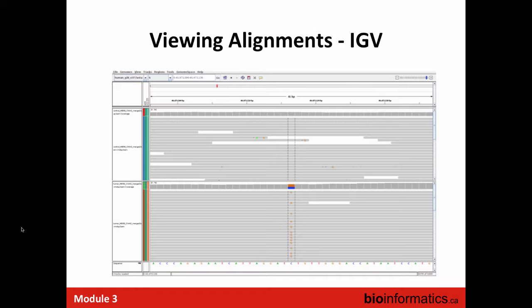So you're comparing simultaneously the cancer to its own normal? Exactly, that's right. You usually don't construct a new reference, because a lot of information gets lost if you do that. The program is comparing the cancer to its own normal and to the reference.